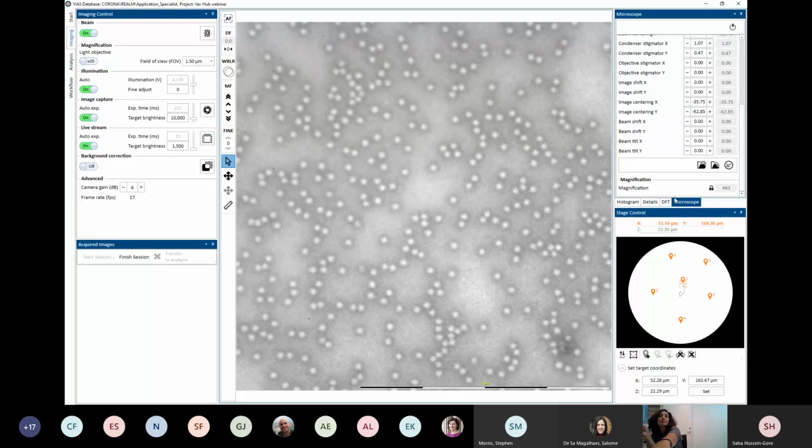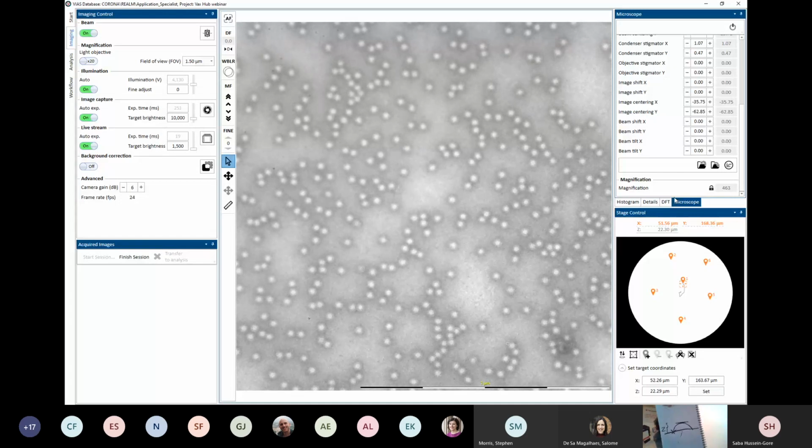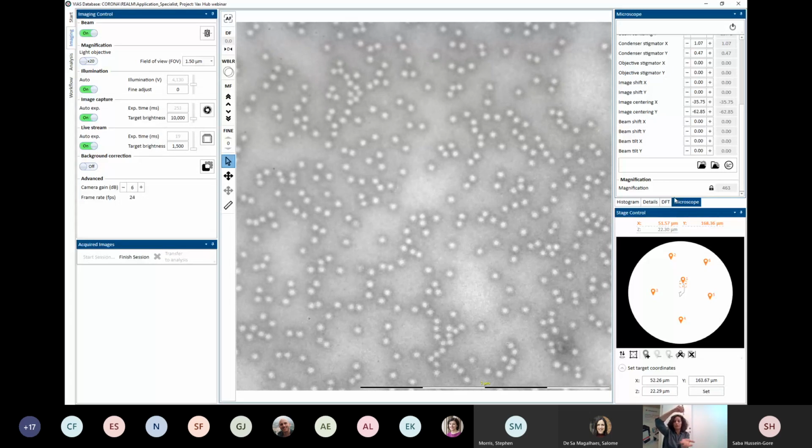The defocus value can be calculated, and we can put this in the MiniTEM. If we think back at that presentation I gave, I showed you that the electron gun is at the top and the CCD camera or detection is at the bottom. The MiniTEM is actually upside down.